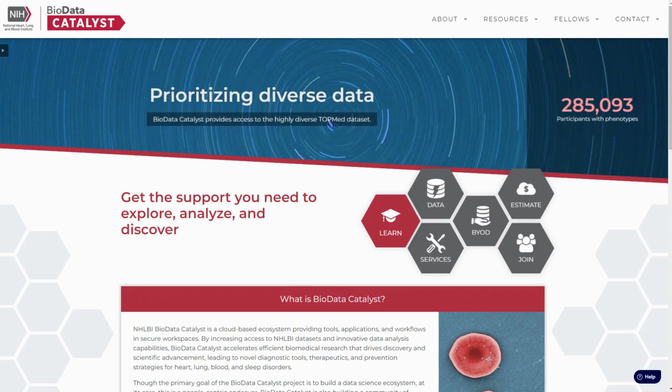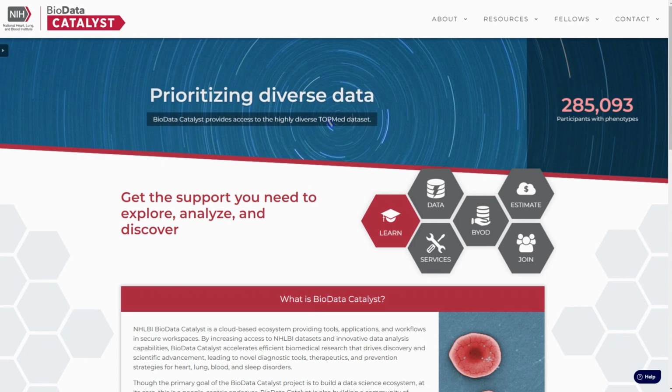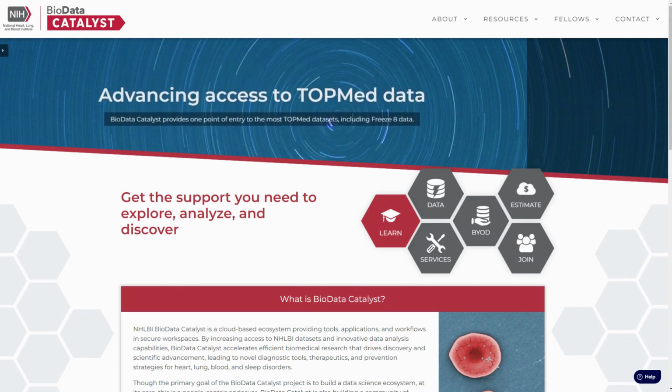Before we get into the 7Bridges platform demo, I want to show you the front door of the Biodata Catalyst ecosystem. So this is the main website, which is found at biodatacatalyst.nhlbi.nih.gov. And this is the main website you need to go to find anything about the ecosystem.